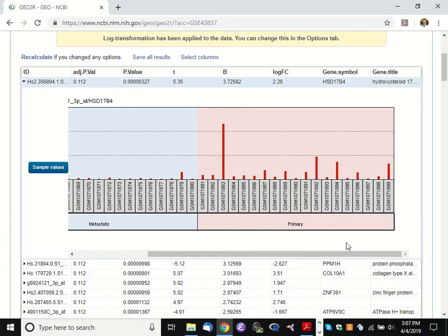So what do we have to give us that information? We have a t-statistic up there, right? So some form of Student's t-test or Welch's or maybe even a pooled variant of t-test has been used here. It produced this t-value of 5.35, and the p-value associated with it is way low, way low. But what about the adjusted p-value? After we deal with the false discovery rate assessment, does this pass muster?